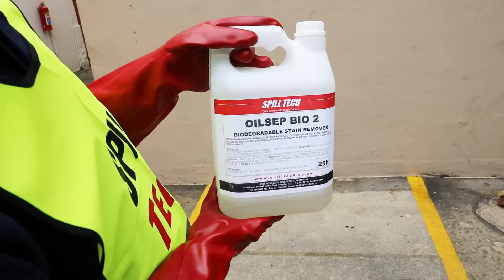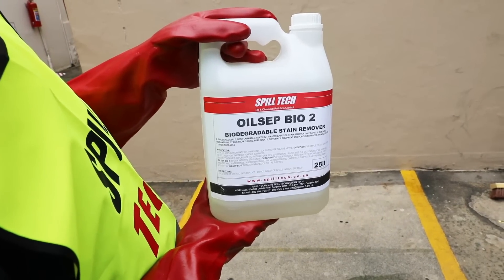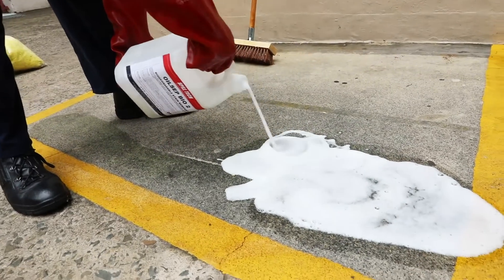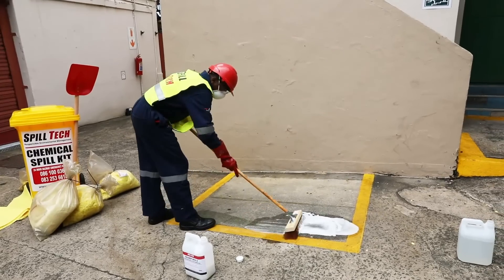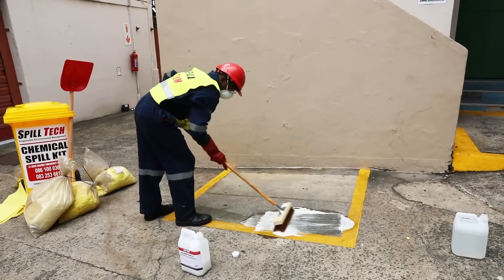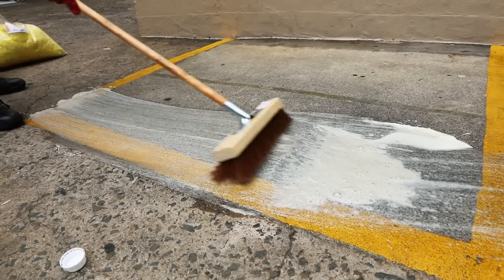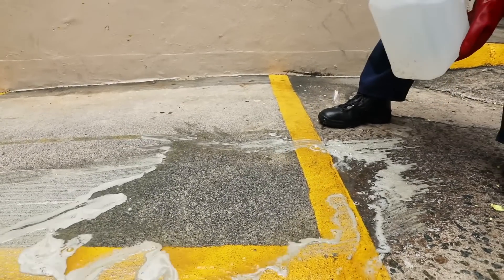It is recommended that you apply Spilltech Special Water Based Oil Sip Bio 2 Biodegradable Degreaser to the area. Pour on the degreaser and work on the area with the broom. The degreaser loosens and lifts the chemicals or oil residue and the area can then be washed or hosed down.